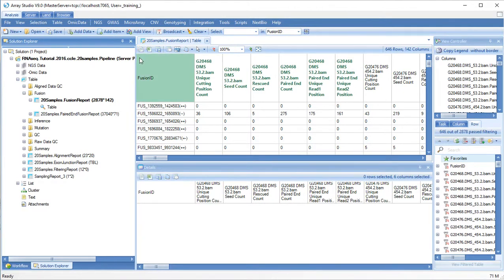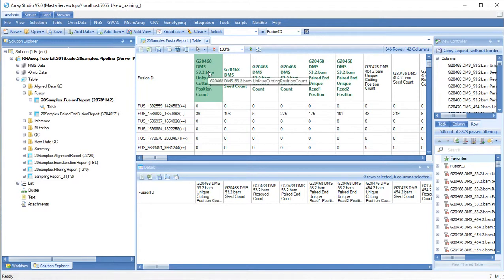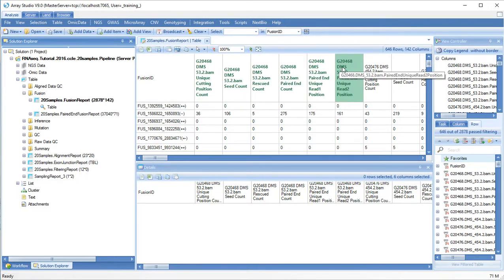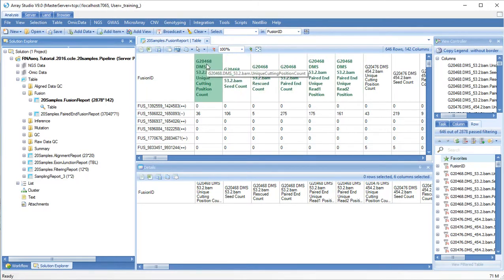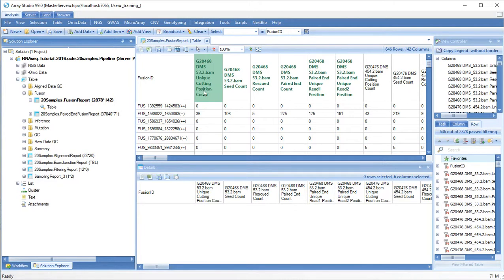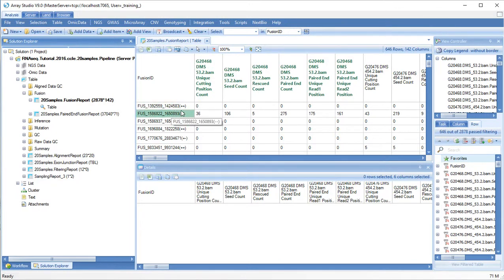In the fusion map report you will find either three or six columns per sample depending on if your data are single-end or paired-end. For each sample you will get a report of the number of unique cutting positions which is an indication of the number of unique reads mapping to this fusion location.